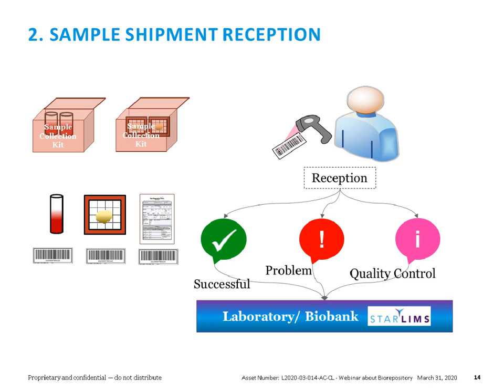So that was the first workflow, let's say, the sample kit preparation, the production and collection of the samples. Now, let's suppose we have all of these samples arriving to the lab, and this is another very important process as part of the biological sample workflow. The samples arrive to the lab every day, and we need to receive them.